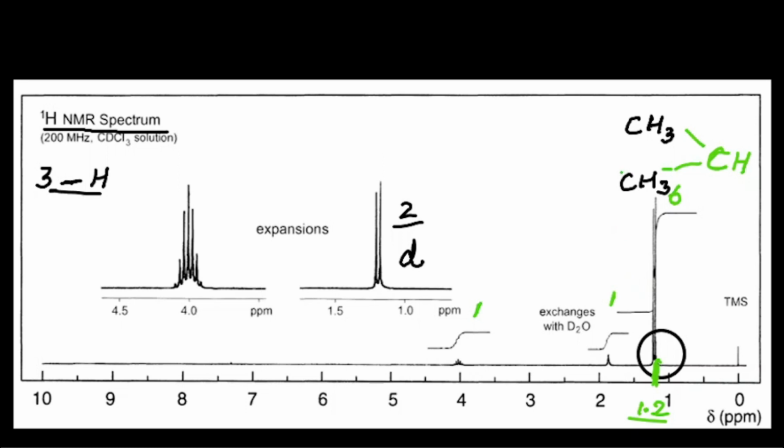If we talk about a CH group or CH2 group, 3 CH2 groups may be present here. So yes, it may be possible, but how will we arrange 3 CH2 groups like this, when only one hydrogen should be present here and we have to arrange the other 2 hydrogens also? If we attach a CH2 group here, a CH2 group here, and a CH2 group here, I can use the other pointer. Just wait. Like this. Now first of all, only one hydrogen should be present in its neighbor. And the second thing is that this should be attached with some other kind of group, and this should be attached with some other kind of group.